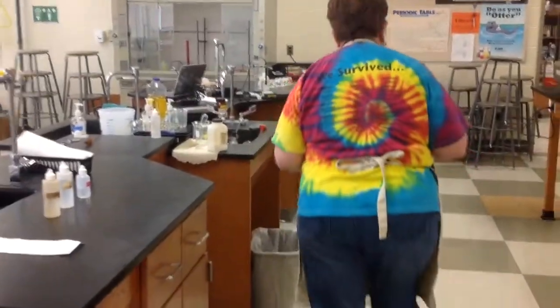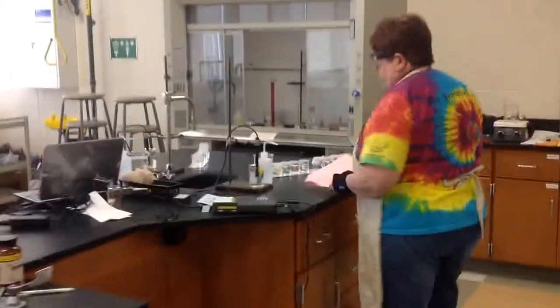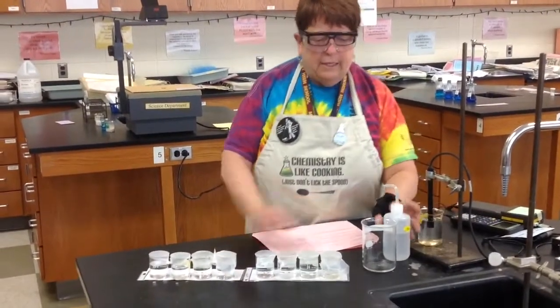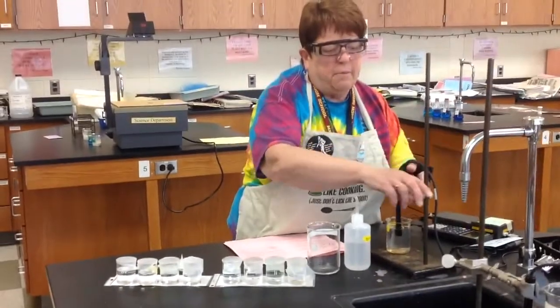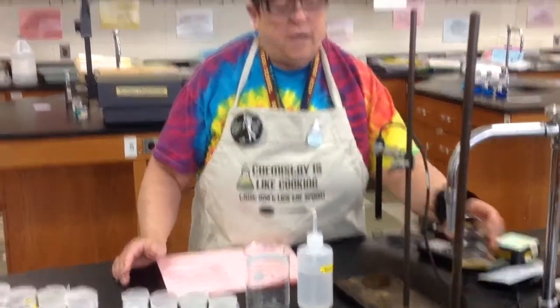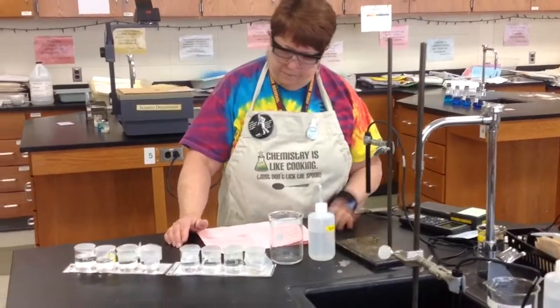All right, station 6 is a biggie. Conductivity of solutions. Why don't you come around on this side? On each side, we have the conductivity probe. When you get here, it should be in a beaker labeled storage. You want to raise the clamp out of the storage beaker. Just lift it and then clamp it up. Put the storage beaker aside somewhere. You don't have to raise and lower this.